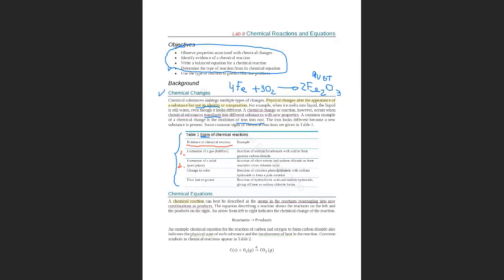If you mix 2 liquids and you see that in your tube it's not clear anymore, or you see a solid, then you are in the presence of a precipitate. You mix 2 liquids and now you have a solid. That is the second sign that this is a chemical reaction. So bubbles, solid. Number 3, changing color. Learn all these 4 because you are going to need it.